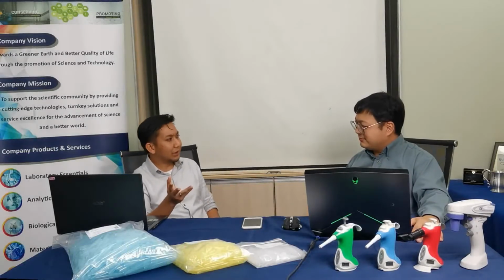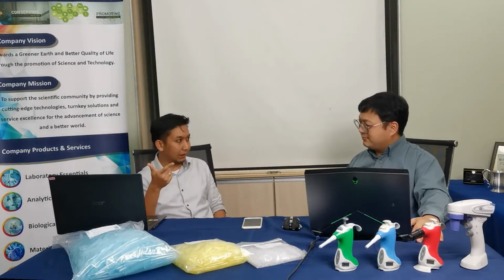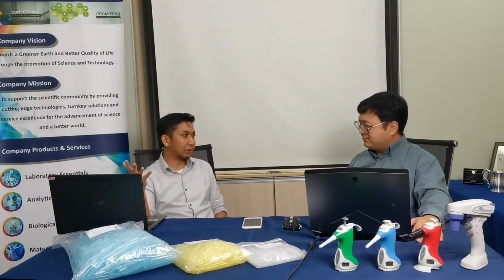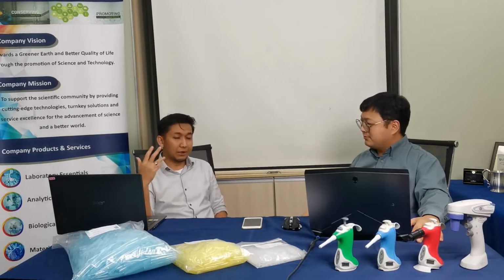So today we have discussed so many things: different types of pipette tips, whether bulk or rack, filtered or non-filtered, sterile or non-sterile, or different colors, different sizes, low retention and normal. There are so many things we have discussed. I think we have learned so many things.